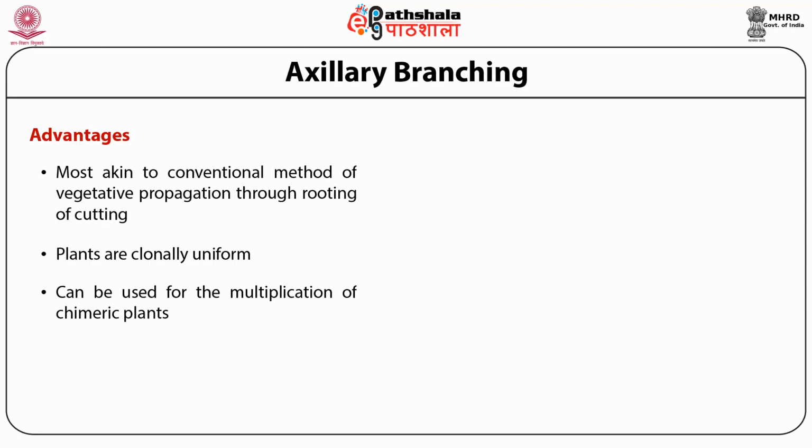We transfer it to fresh media largely because, after 2 to 3 weeks, the culture media gets depleted in the major salts, and there is also a general healing process. So the cut end gets sealed, and it will no longer absorb nutrients.